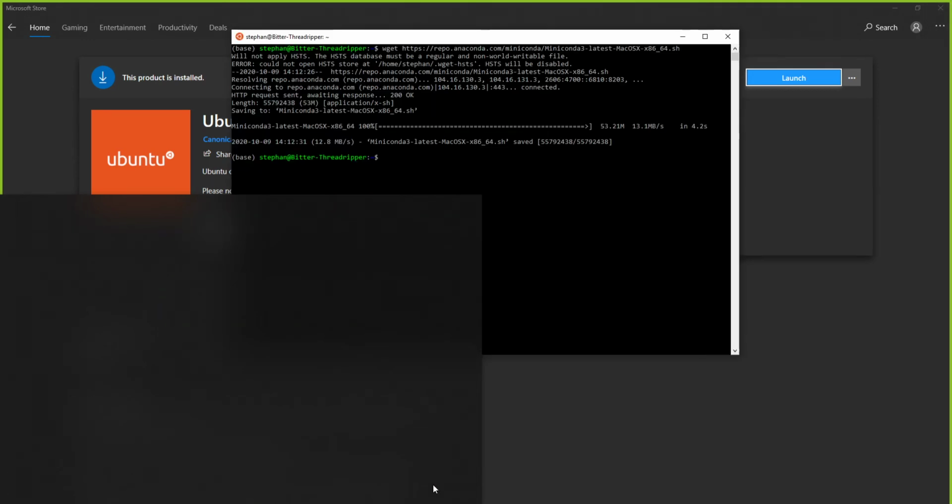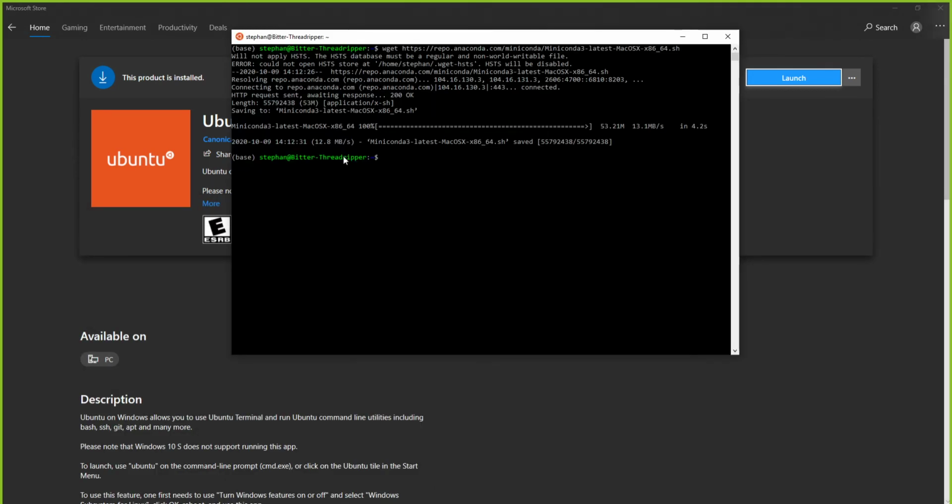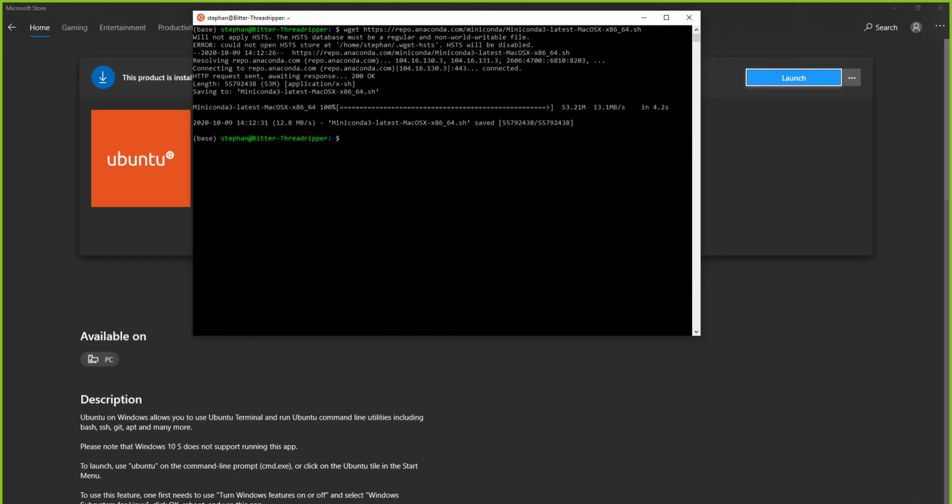So do you mean you coded it in sort of this environment like I'm showing on my screen? I can't see the screen. I have too many things open. Hang on a second. Oh, okay, that works. Let's see. See, I've tried so many things.